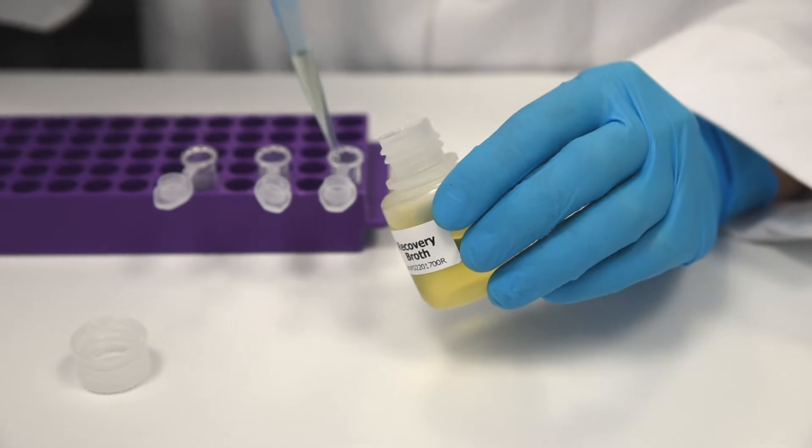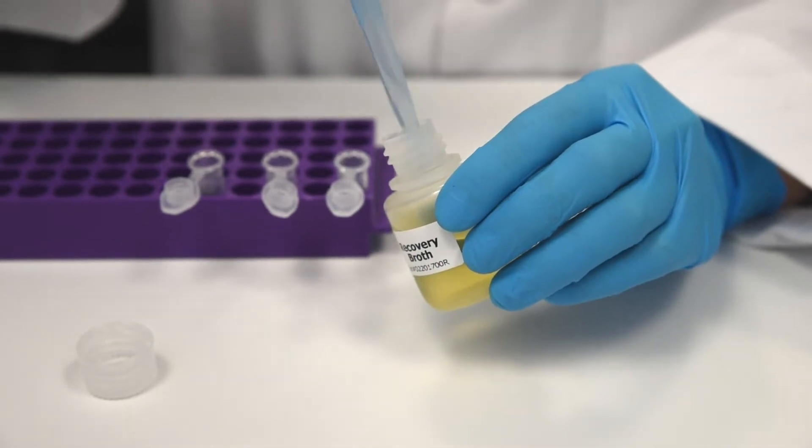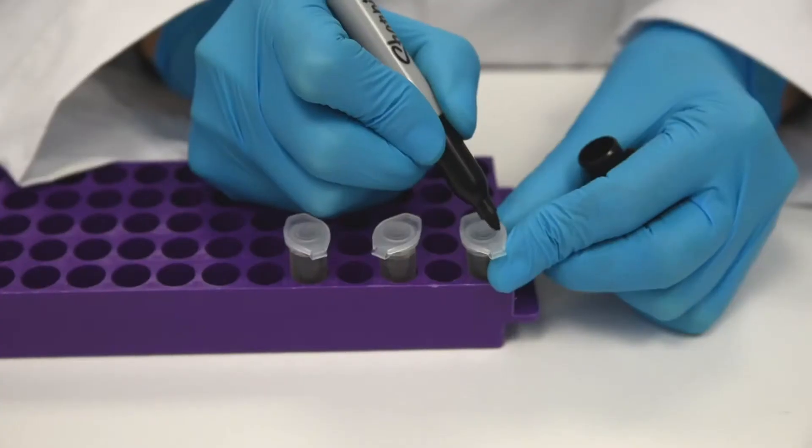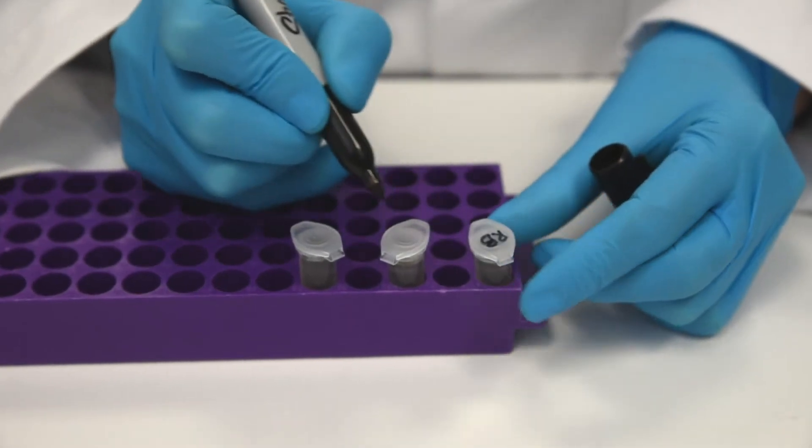Step 4: Dispense 1.5 mls of recovery broth into tubes for each of the 10 groups and keep at room temperature. Make sure to maintain sterile technique while aliquoting the recovery broth.